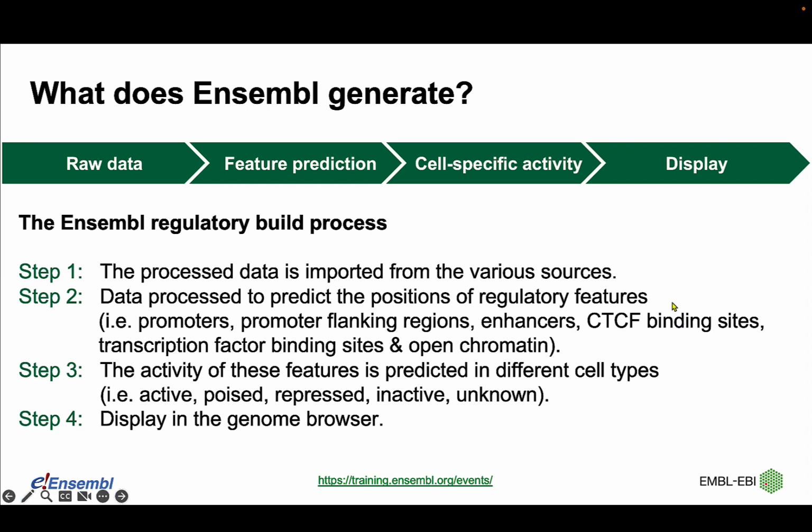Then we process the data to predict the positions of the regulatory features, so the promoters, enhancers, or transcription factor binding motifs. Next, we assess the activity of these different regulatory features in different cell types. And then finally, we display the regulation data on the browser.